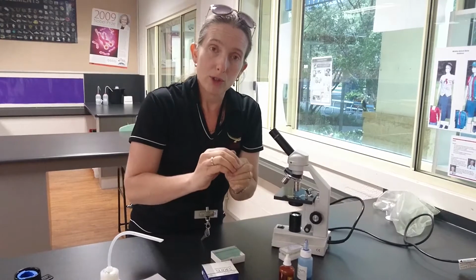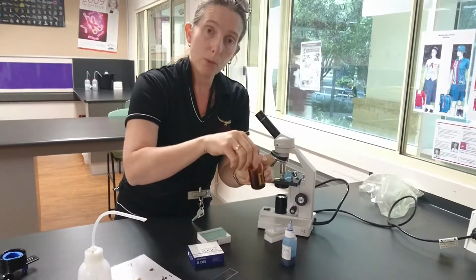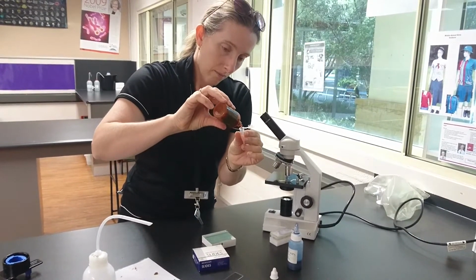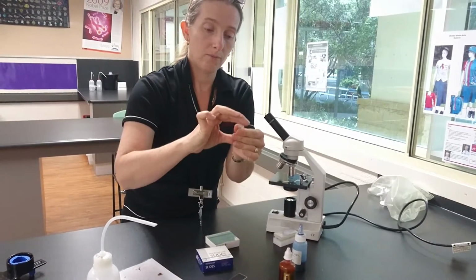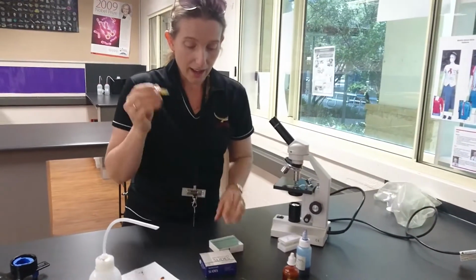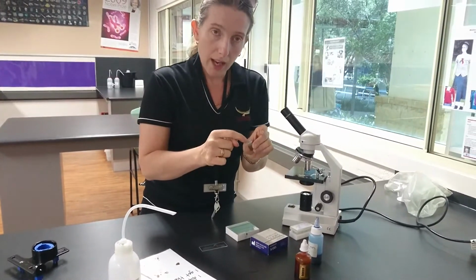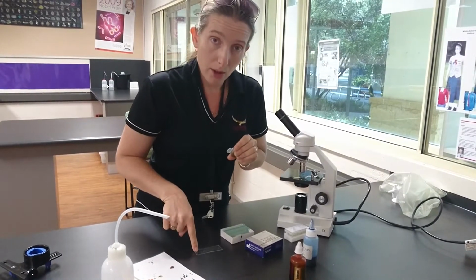Now if you're told for certain ones to add dyes to them, then you have to add a dye. The most common one will be iodine here, because if there is starch in that cell, then it will turn black. Just one drop, and again you clip it on, shake it, try not to throw it, and the next thing is you're going to have to make sure that you label it. Now I haven't got my pen here, but you will need to label what you think it is, or give it a number and put that same number on your slide.